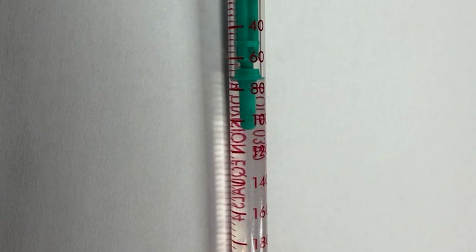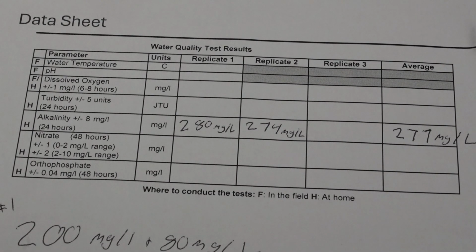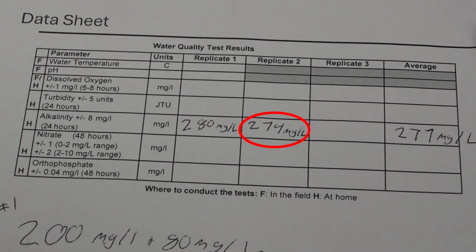For example, if the ring is in between 72 mg per liter and 76 mg per liter, your result would be 74 mg per liter. Please remember, if you refilled your titrator, add 200 mg per liter to your final alkalinity value. For example, if you refilled your titrator once and took the second reading at 74 mg per liter, your result for this would be 274 mg per liter.